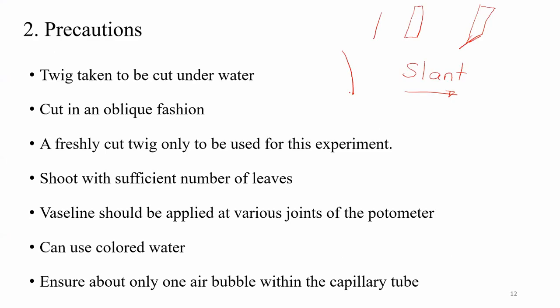Any doubts regarding this practical, the precautions, observations, procedures, calculations? Any doubts? All of you understood? Yes, ma'am. Okay, fine. Then in your discussion, you should discuss what the limitations are in choosing this experiment. The Ganong's potometer experiment, what limitations are there?